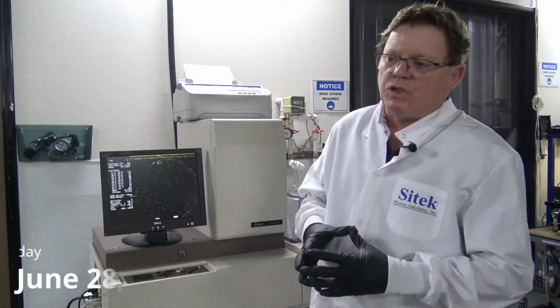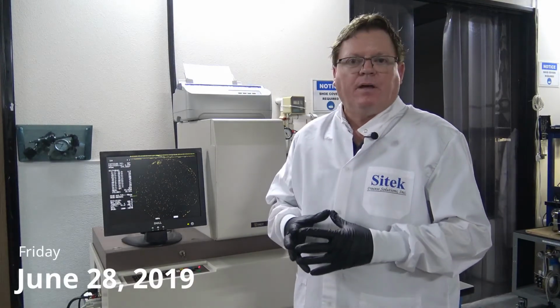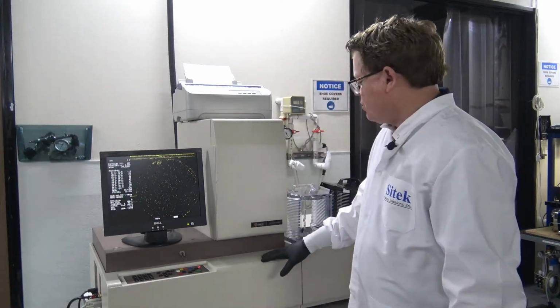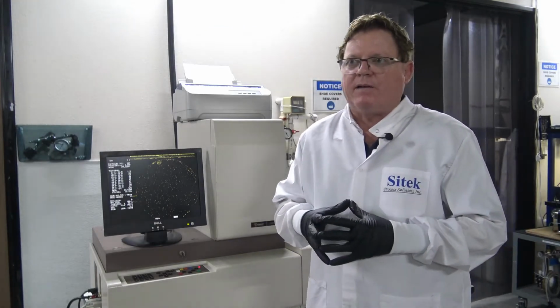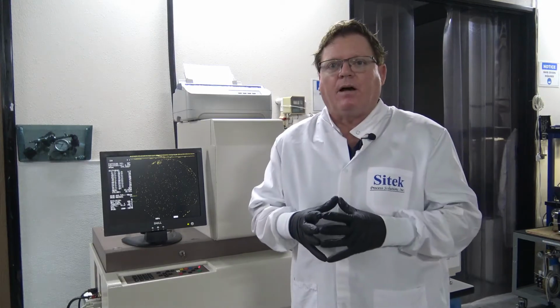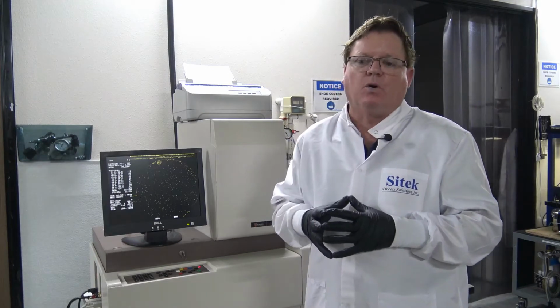Today is Friday, June 28th, I believe. I think it's the 28th. Today I'm doing a very quick video source inspection of a Tencor Surfscan 5500. This customer purchased this tool from us. They gave us a verbal PO, so there's no PO number, so I won't reference that. The customer is in the Arizona area, and they are driving up tomorrow to pick up this tool.